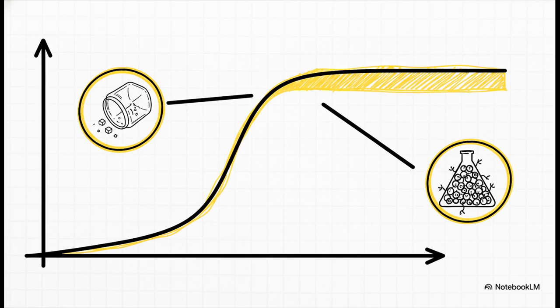But why? Why does it stop? Well, the yeast population has probably hit its limit. Maybe they're starting to run out of food, or maybe the flask is just getting too crowded. The growth slows way down, the population stabilizes, and so the cloudiness, and therefore the absorbance, stays constant.